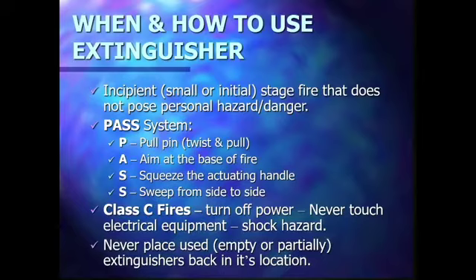If you are not trained, please do not take any chance to try to extinguish the fire. Get help. Call for help. It is better not to risk your life. Life safety is very, very important. Again, I would like to emphasize this. Please, if you are not trained, do not try to use the fire extinguisher.